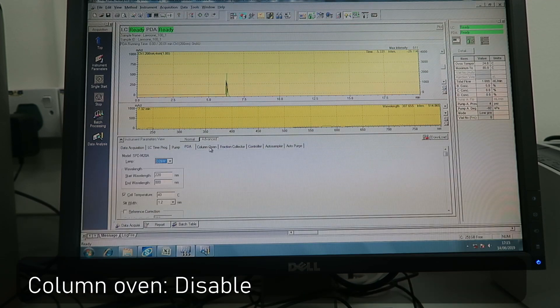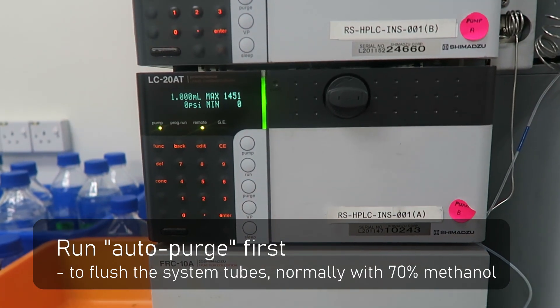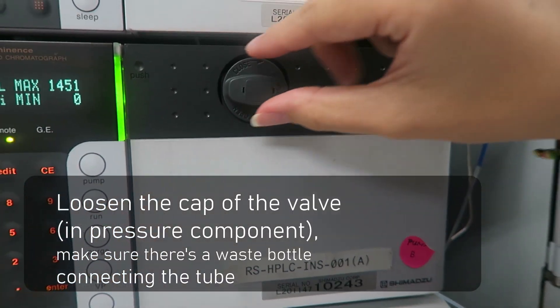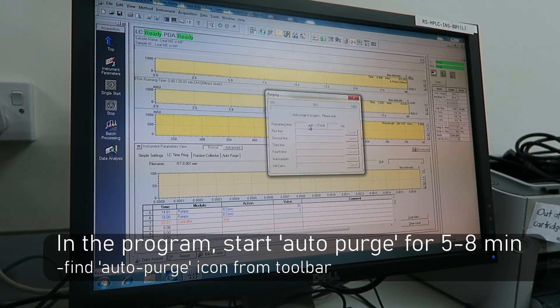You also set the column oven. All settings should be customized based on your experiment objective. Then you can save it as the method file. After that, run autoflush to make sure the system has been flushed properly using 70% methanol, and run for 5 to 8 minutes.